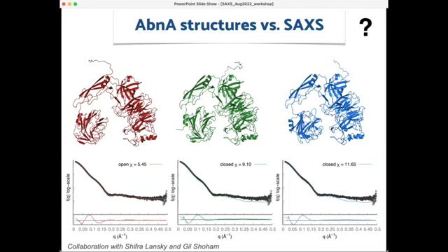The disordered regions are different. Disordered, yeah, but it's quite a big structure, and the disordered region is not that big relative to the whole structure. There are several domains here. I try to look at the distances between the domains in the 3 structures. Just the motion of the N-terminal domain.